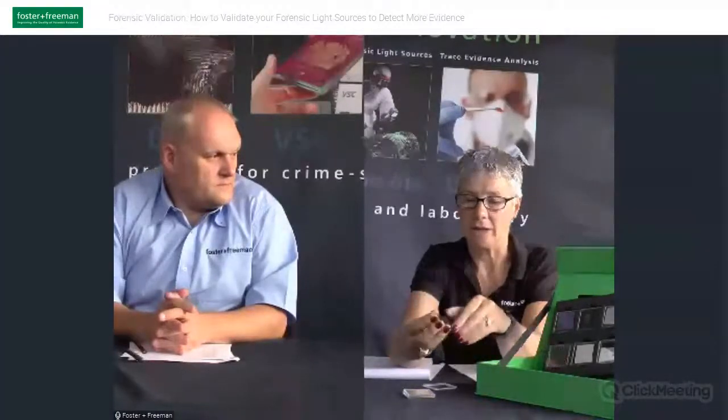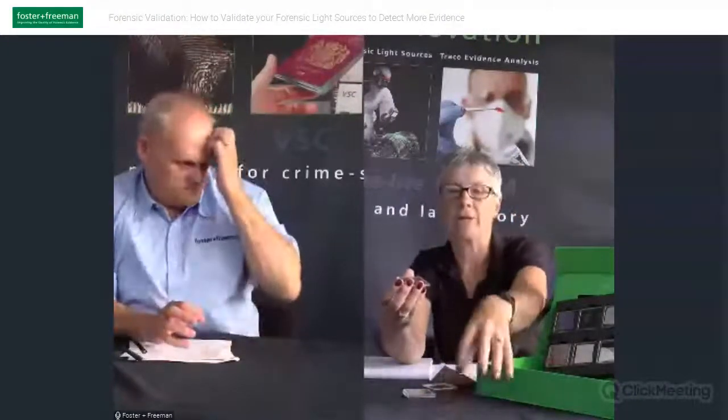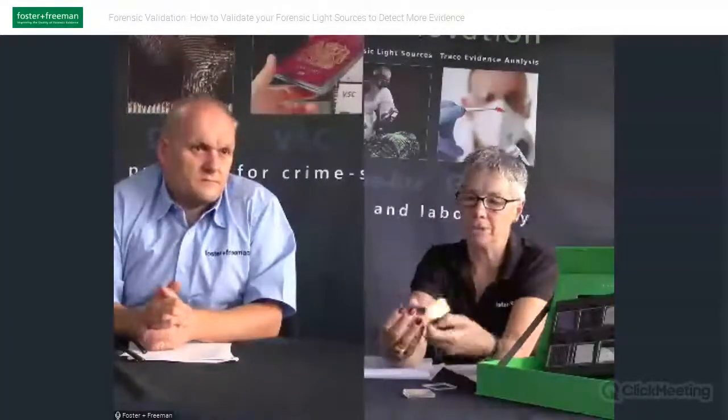The samples, such as the brass plates, are actually better taken out to get a really good visualization of the fingerprint. Using the coaxial box accessory of the Crime-lite Auto, you can place it down on the table and place the coaxial box on the top. So that's a sample that's better taken out. Again, labelled on the back, so you're not going to misplace it.